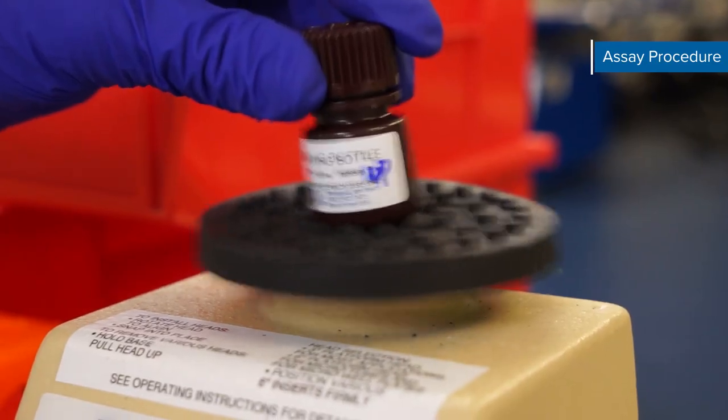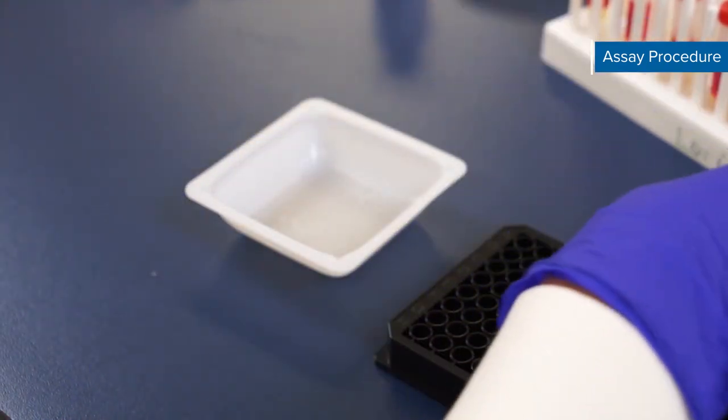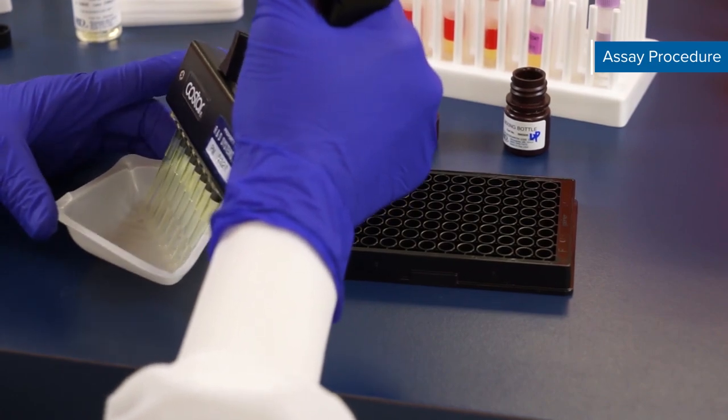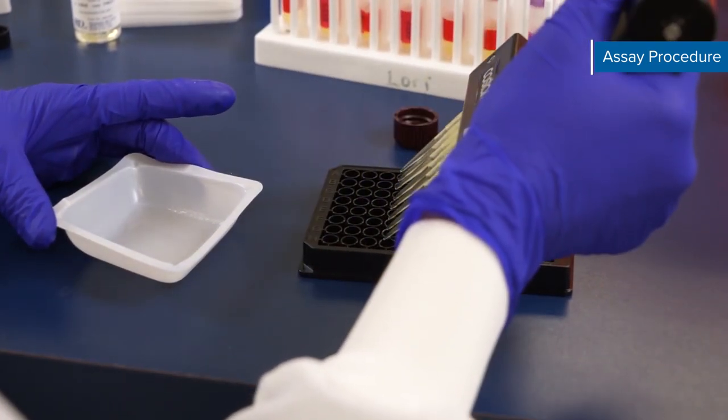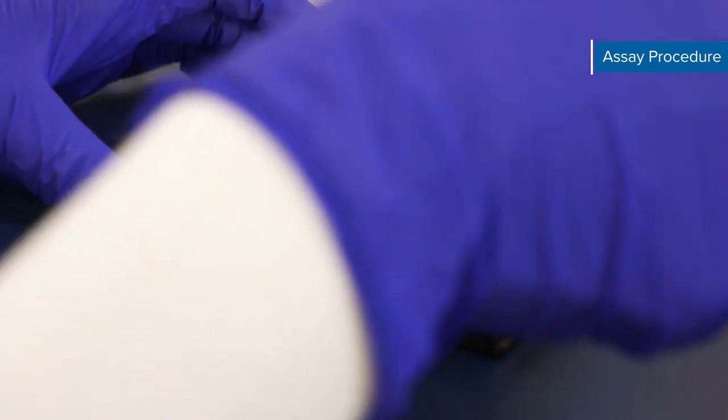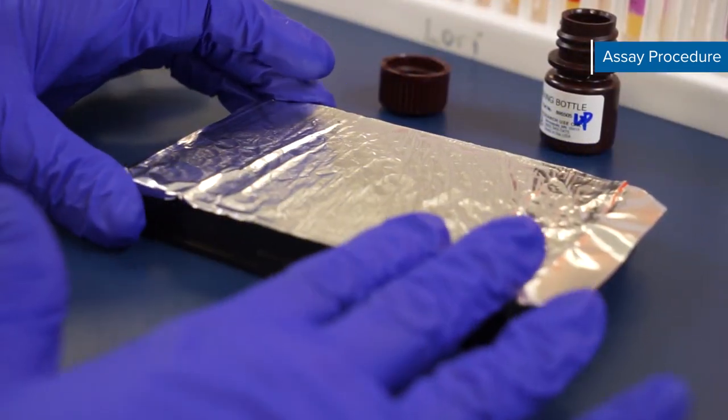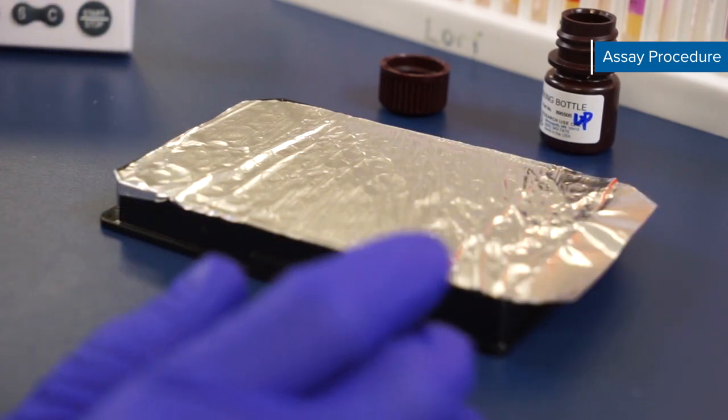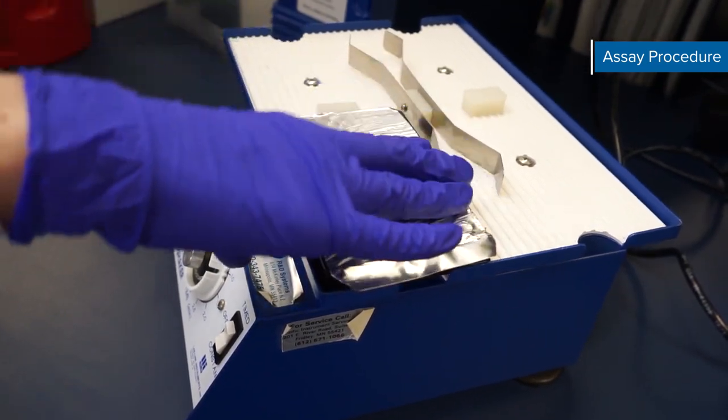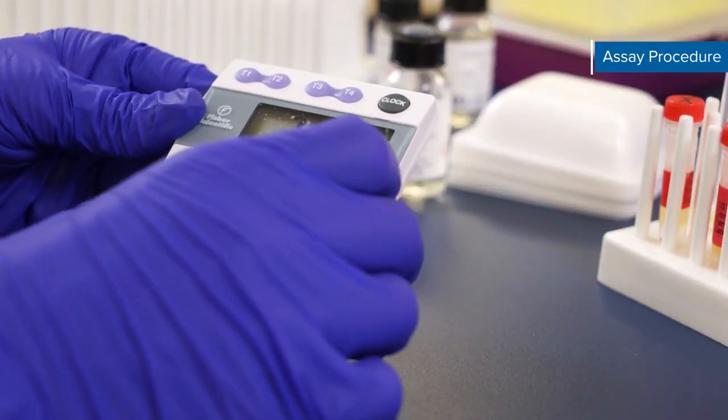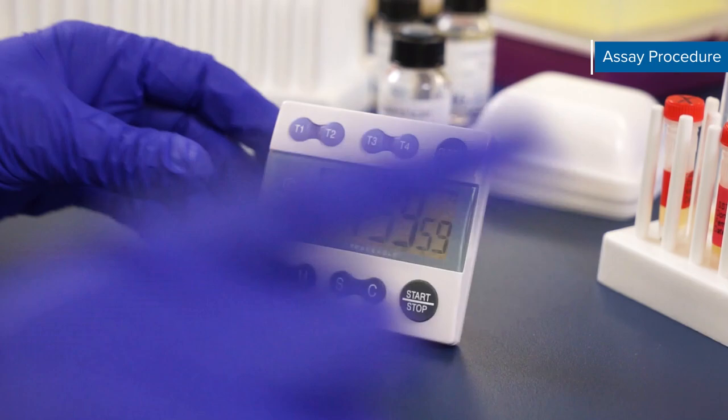Next resuspend the diluted microparticle cocktail by vortexing. Add 50 microliters of diluted microparticle cocktail to each well of the microplate containing standard, sample, or blank and securely cover with a foil plate sealer. If you're running a partial plate you can cut the plate sealer to cover the wells containing liquid and save the other section for your next assay. Now incubate for two hours at room temperature on a shaker at a 0.12 inch orbit set at 800 plus or minus 50 rpm.